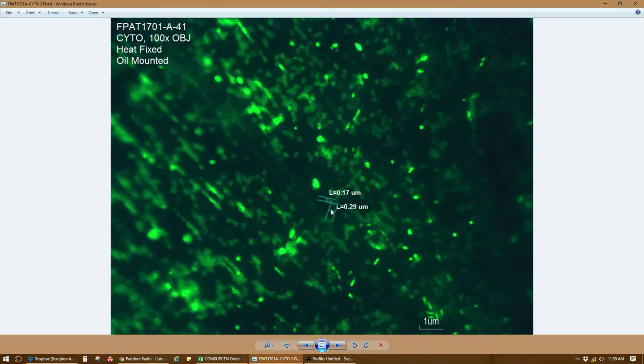And then you can see I measured the width and length of the objects in the sample, and labeled it with a micrometer scale. It's good, I think, to use a micrometer scale that applies to some of the dimensions that you're looking at. So I wouldn't want to put a 10 micrometer scale on here because nothing is on that order of magnitude for size. Again, here just labeling what I consider to be representative dimensions, since these are ovoids, not using the circle from 3 points technique, but measuring length and width.